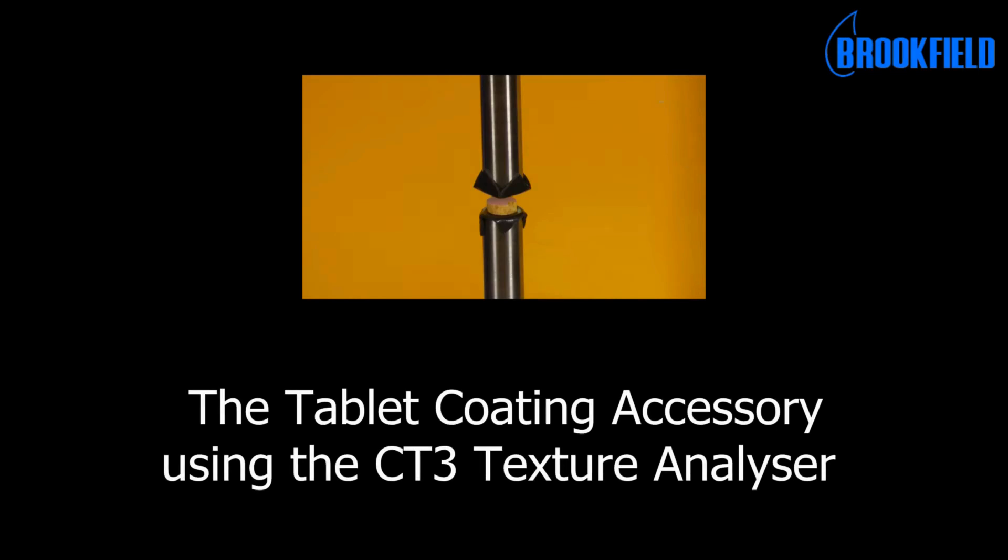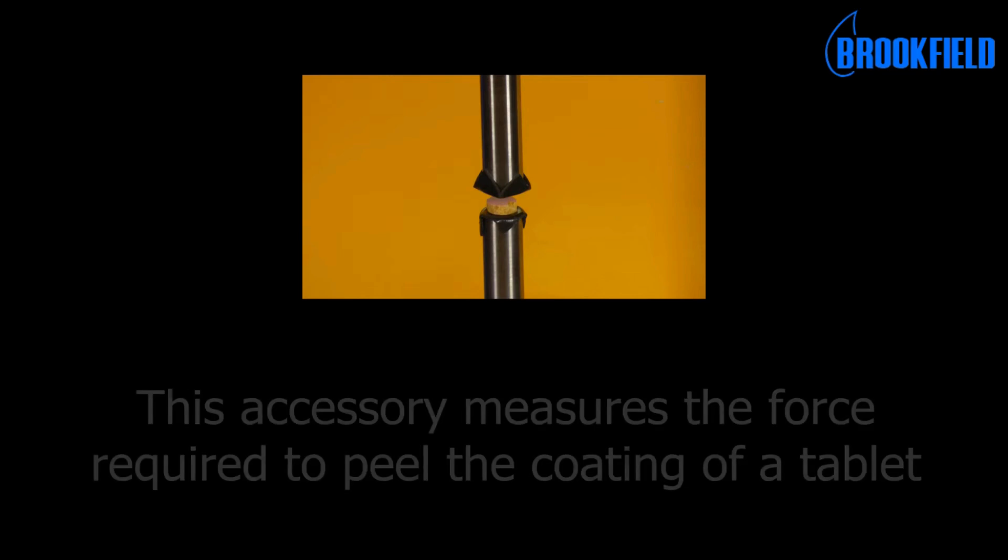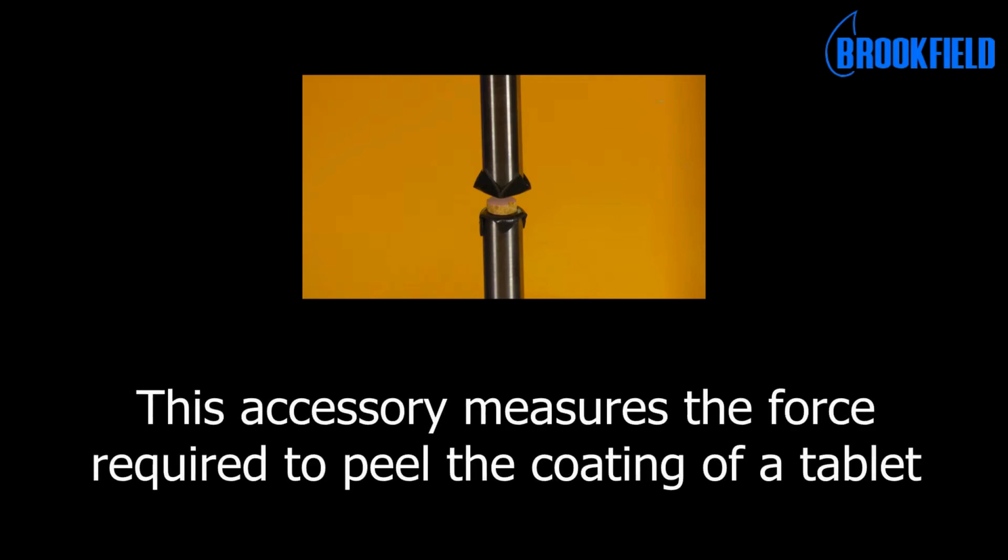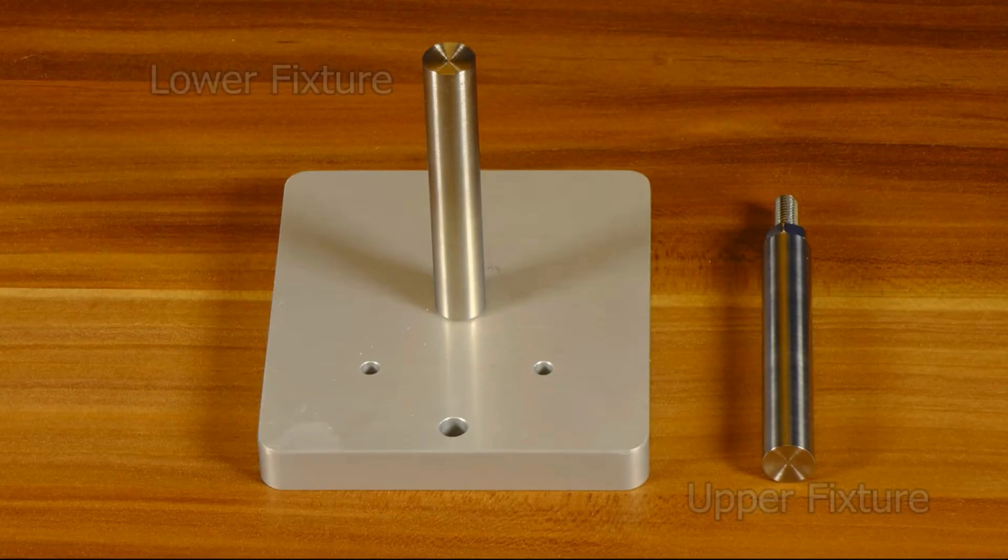This is the tablet coating accessory using the CT3 Texture Analyzer. This accessory measures the force required to peel the coating of a tablet. Here you see the individual parts of the accessory.